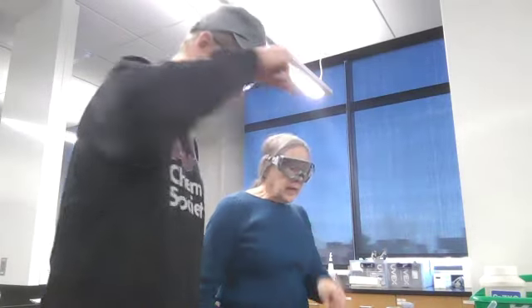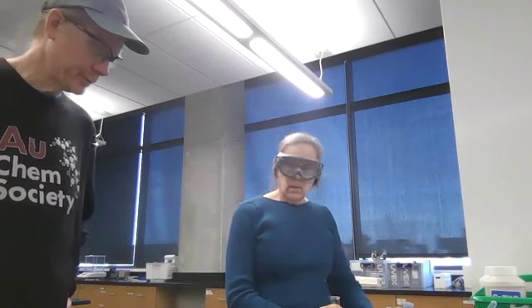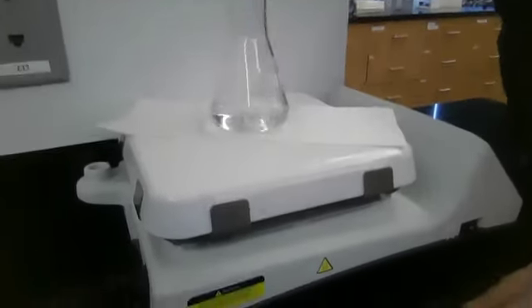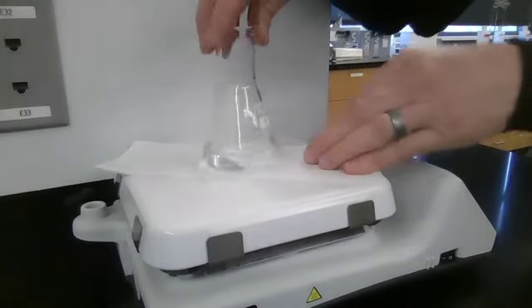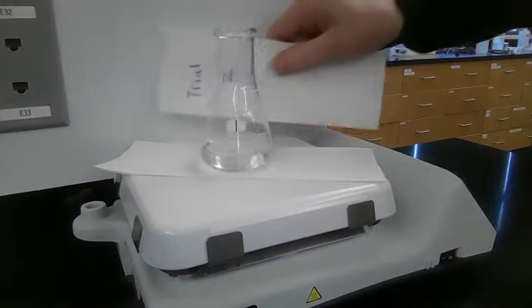Fake trial. Are you going to redo that beaker, or what are we going to do? I'm going to redo that, and I'll remake that solution set. As you can see, we have a stir plate set up, and this is flask 1 for trial 2.